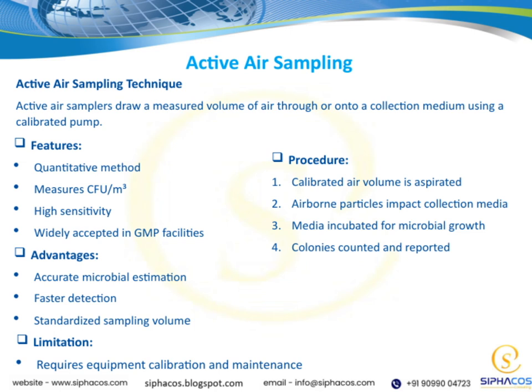Now, regarding the advantages, active air sampling offers a more accurate estimation of microbial presence compared to some other methods. It also enables faster detection, which is crucial for maintaining sterile conditions.